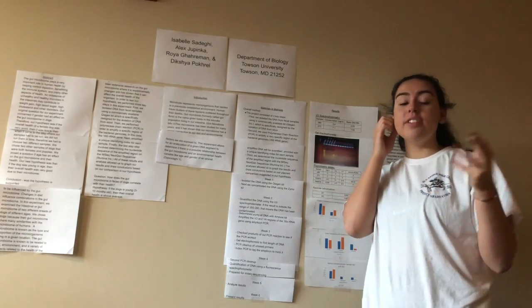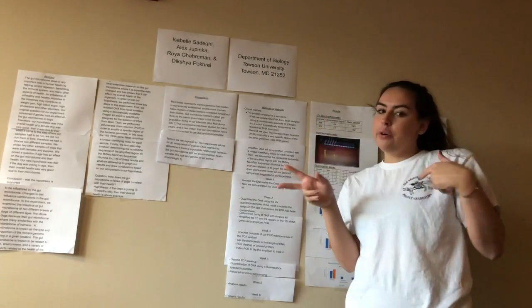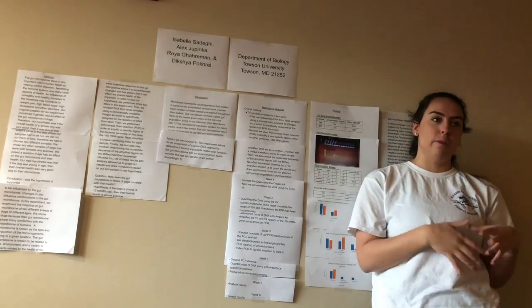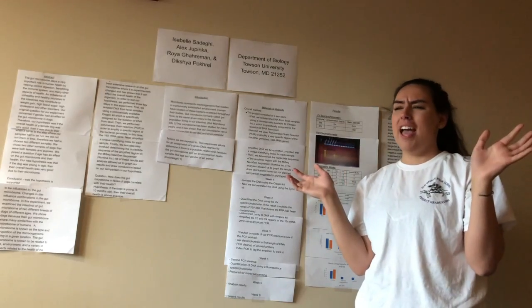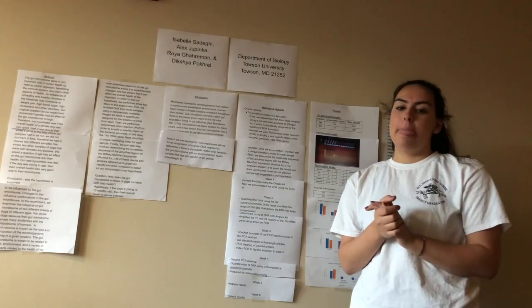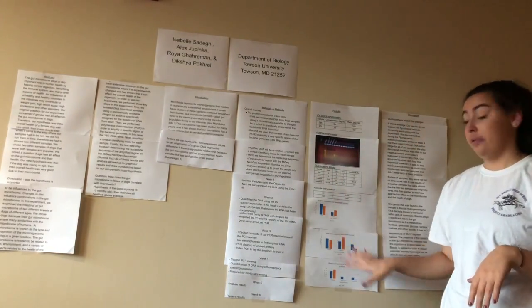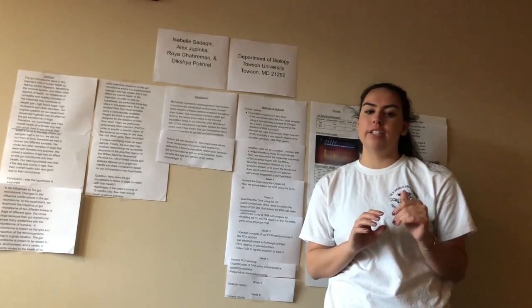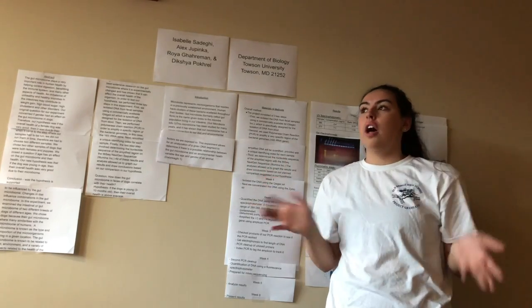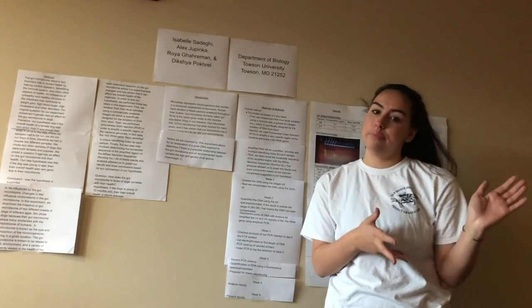The categories other and unclassified mean 2 different things. The other category is reads that can be identified, but were found in less than 3.5% of the total reads, and can be considered unimportant. However, the unclassified category, which was found in all of them, consists of reads that don't match any known organism within that level, which most likely resulted from errors in the reads.